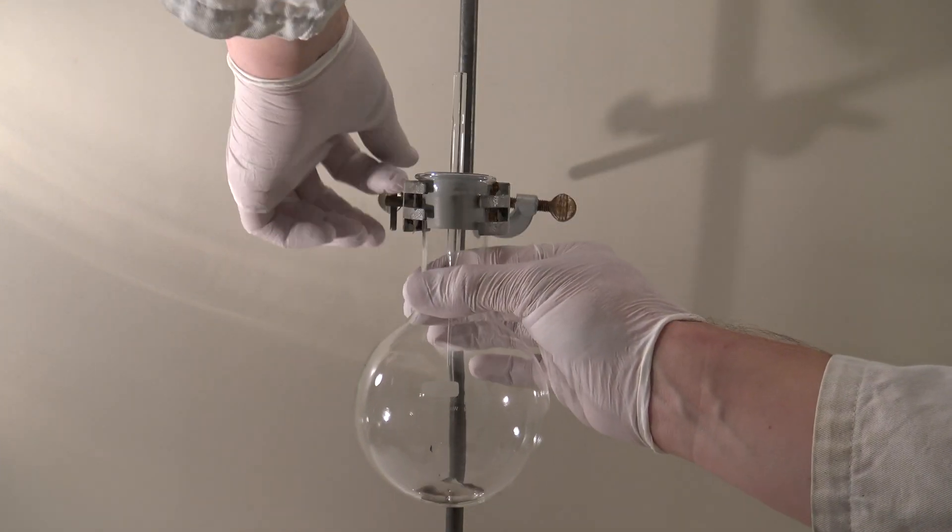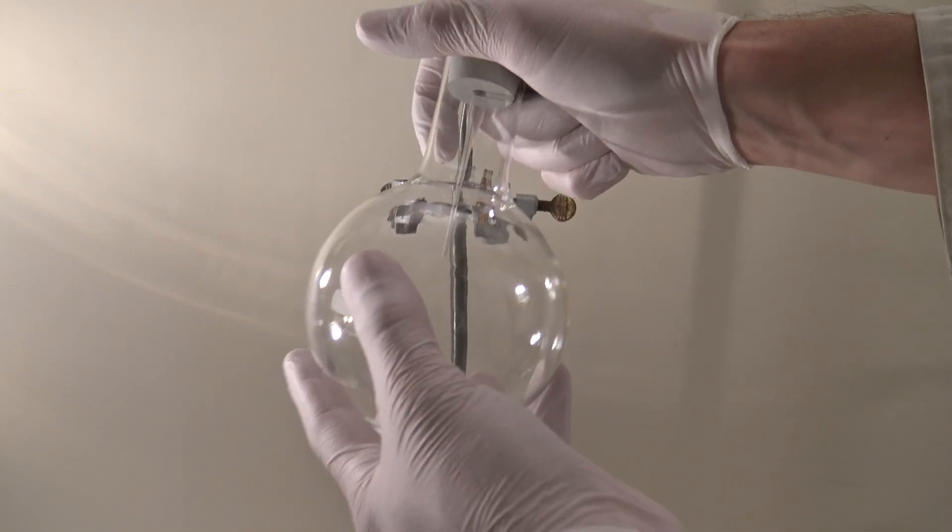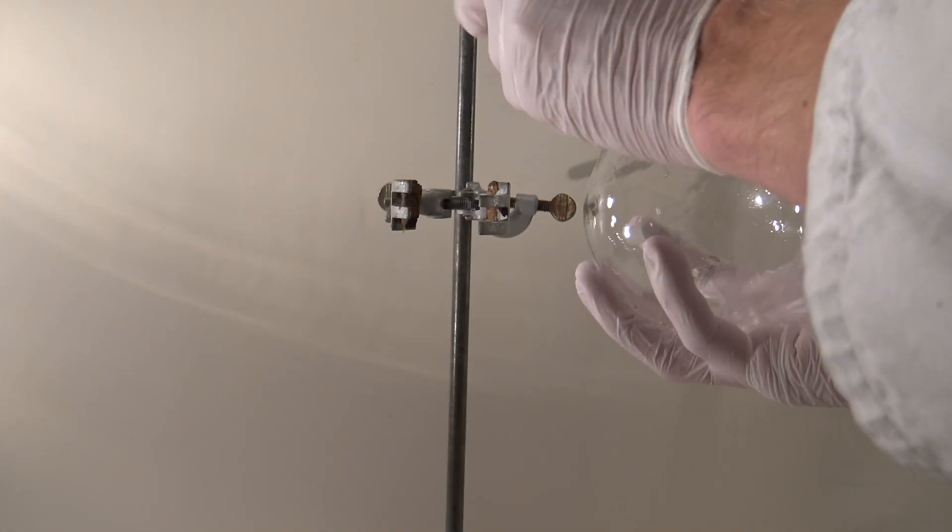By shaking the flask, the air on the inside is saturated with ammonia, then the flask is turned upside down and attached to a ring stand.